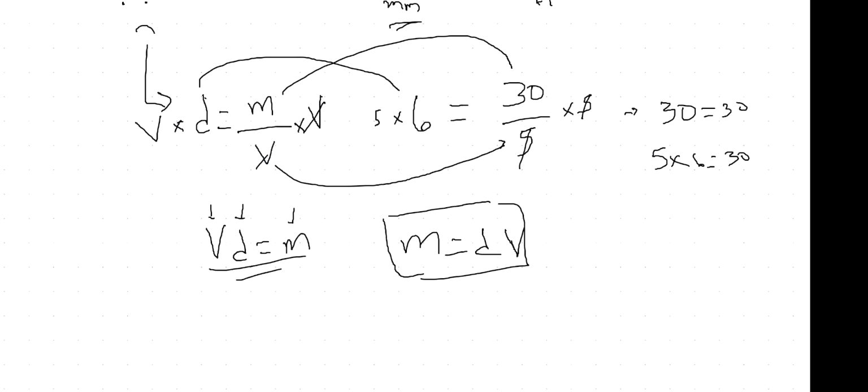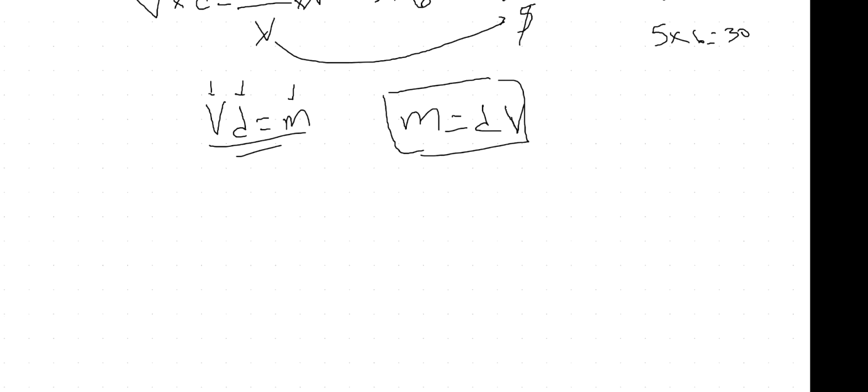Now, what we want to do is some things with copper. We're going to have a little piece of copper like this. We don't know the mass. Well, what could we do? Of course, we're going to put it on a balance, and I'll talk about that in a second. My other question is, how do we get the volume of this? If we know math, we can measure the length and width, the area on the top, the length here. But we want to get the volume of this little cylinder. That's what we're going to talk about right now.